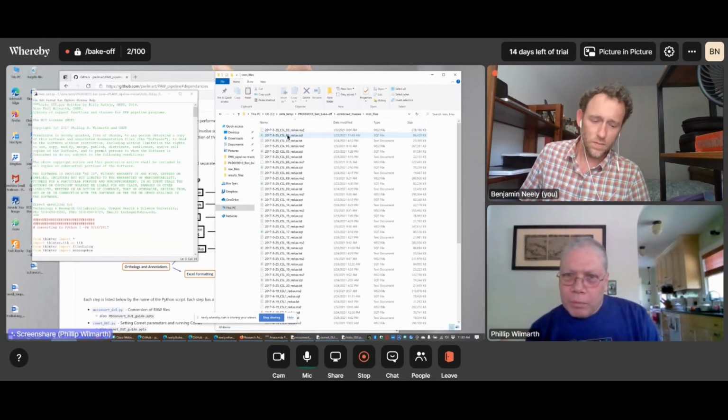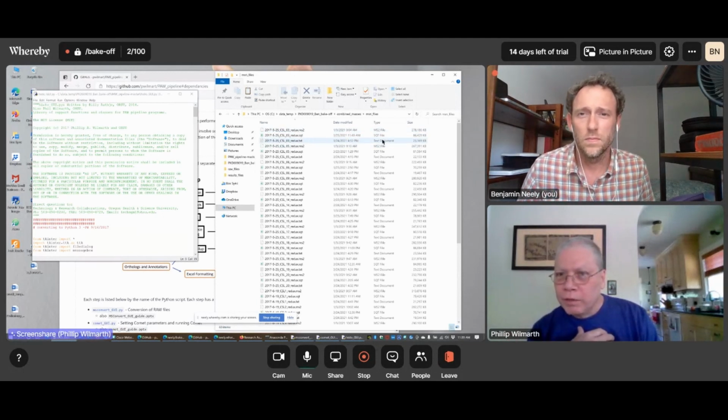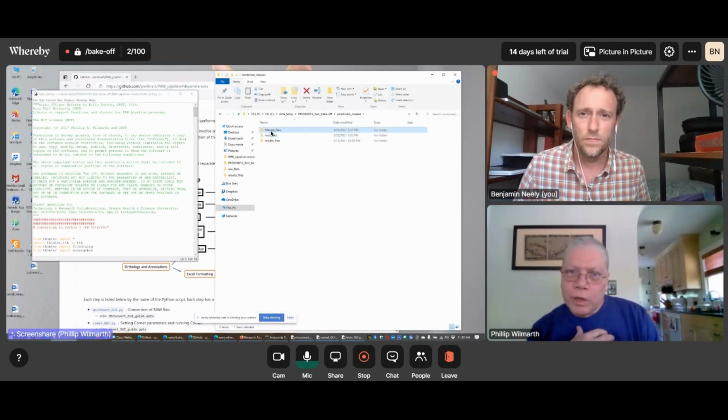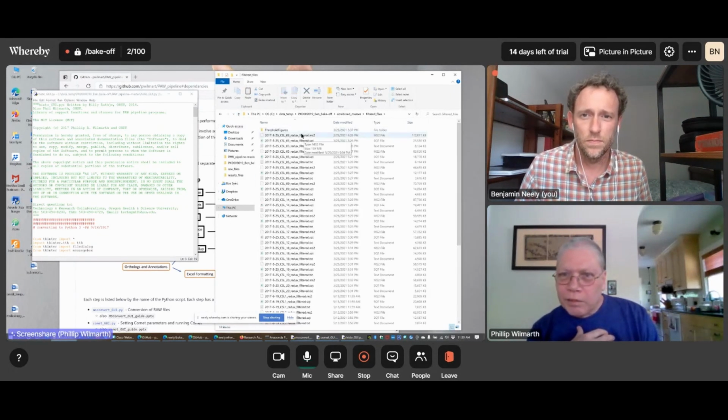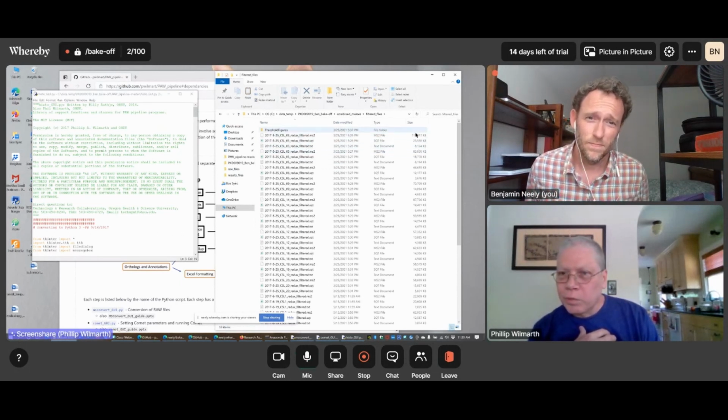So what we have in the MSN files are all of our original SQT, MS2, TXT files, and they're pretty large. And then we get into the filtered one, we'll have the same set of 3 files for every raw file, but now they're much smaller. That's associated just with the peptides that passed our score thresholds.